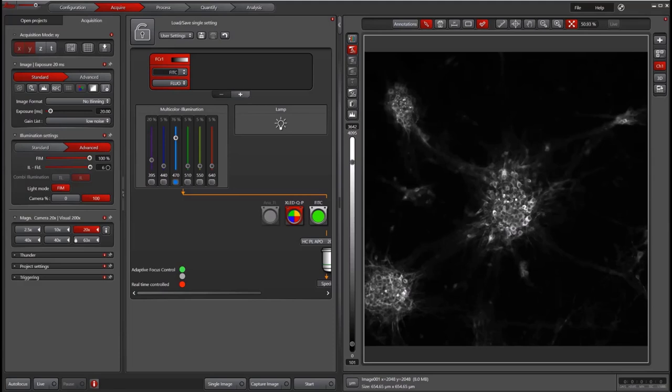Software autofocus works with your MotoI Z to run a Z-Stack and identifies the area of best focus. There are two versions of autofocus: best focus and high-speed autofocus. On this system, I only have high-speed autofocus, so that's what I will demonstrate. The good news is that best focus works similarly but is much easier to use.